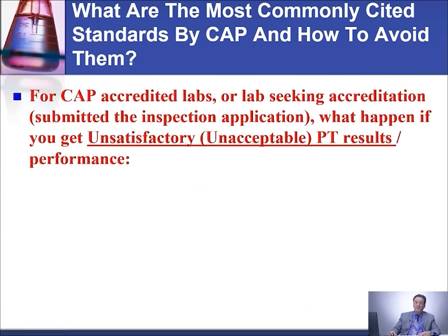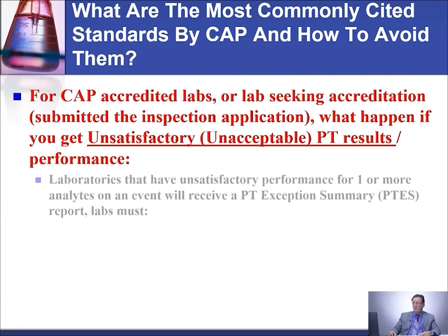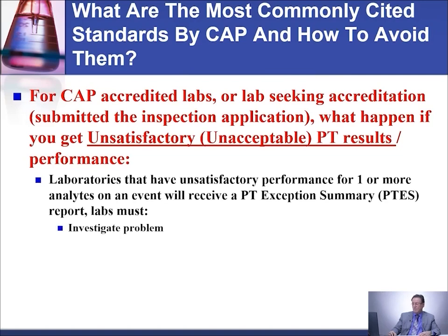Now, if you are CAP accredited or you submitted your application for CAP accreditation, then if you fail or you get an unacceptable PT, CAP will send you a notice called PT Exception Summary Notice, PTES notice. Okay.